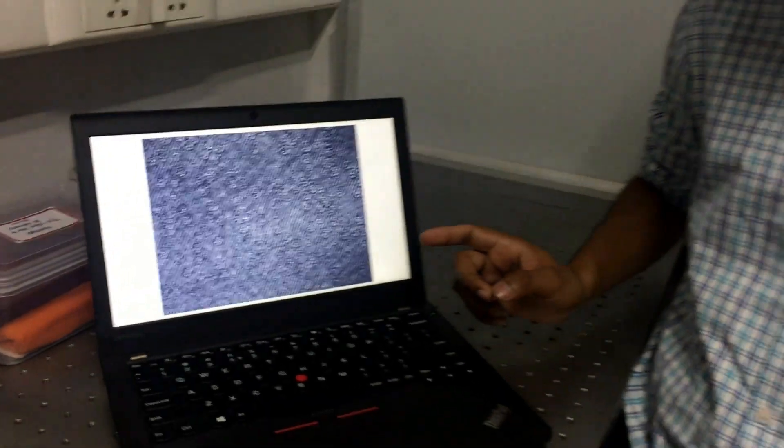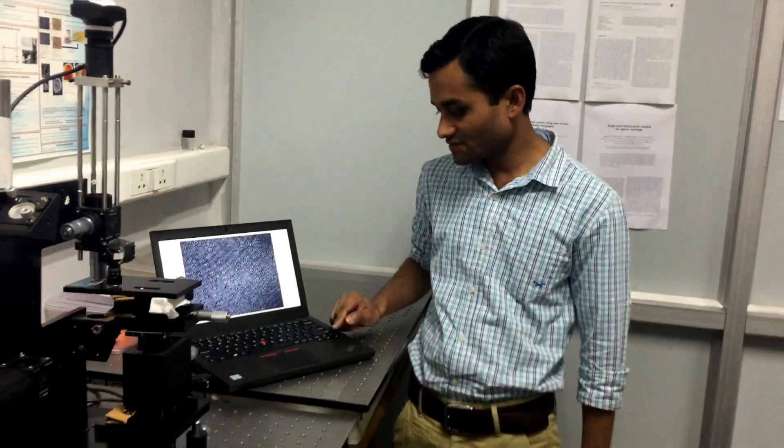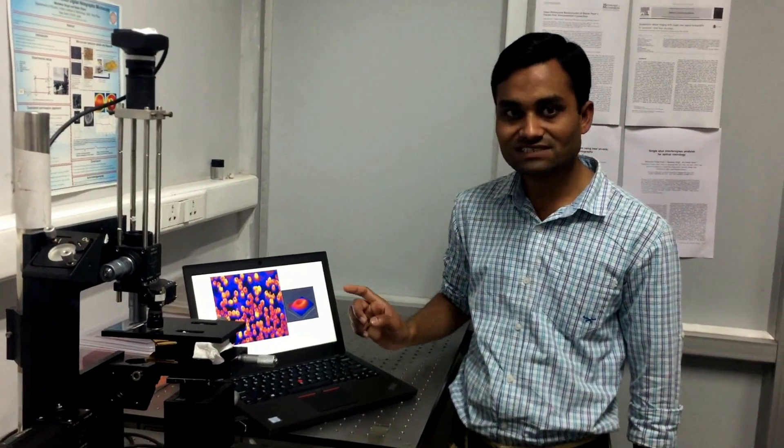This is how an interferogram looks like. Our patented algorithm uses this interferogram to generate a 3D image of each cell.